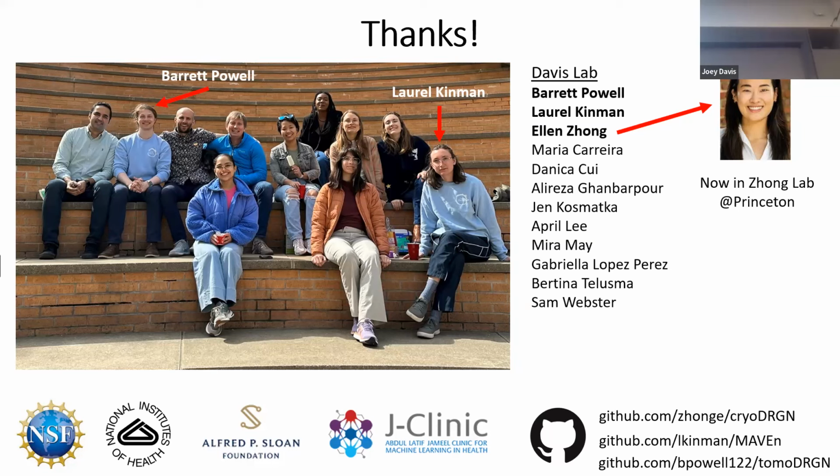Yeah, it's a great question. I would say that is true in general. The maps that we generate are low resolution relative to what you can get if you just focus on the structurally homogeneous particles and isolate those to increase your averaging capacity to push the resolution. That's a conscious choice. You tune that dial however far you want to go, based on how much data you want to throw away and how homogeneous you want things to get.